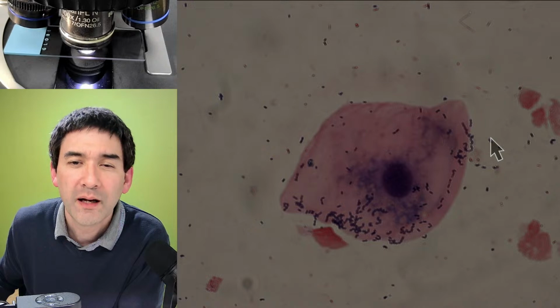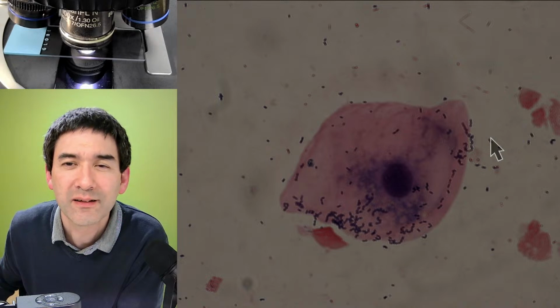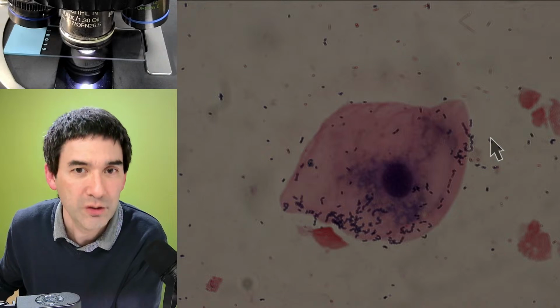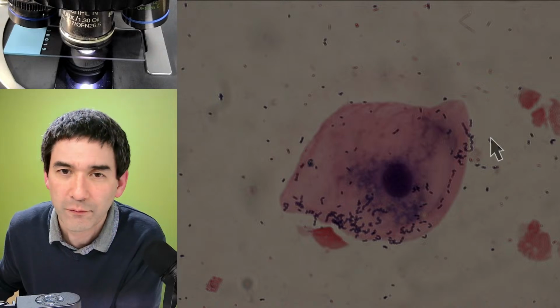Yeah, have to go now as well. Okay, and I think I also have to go. Okay, the bacterial cluster around the epithelial cells. Yeah, I saw this with my own cells and methylene blue as well. Interesting. Yeah. I don't know if they have a specific affinity for the cells or not.